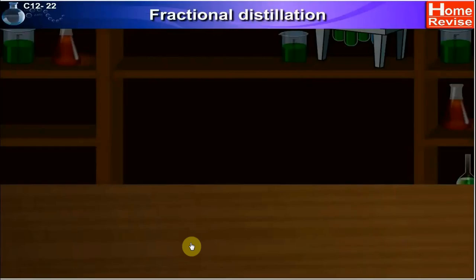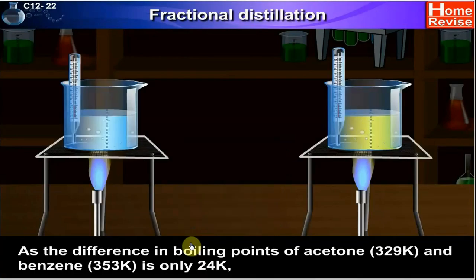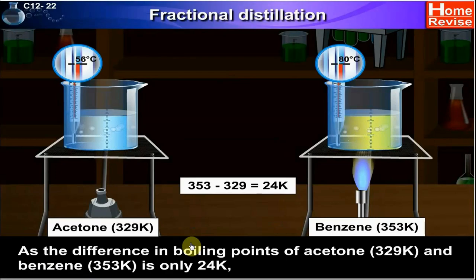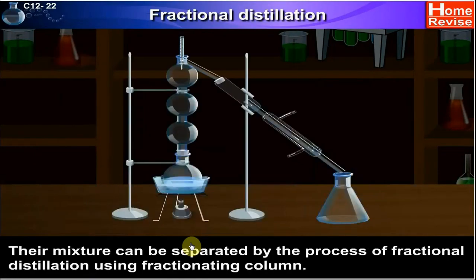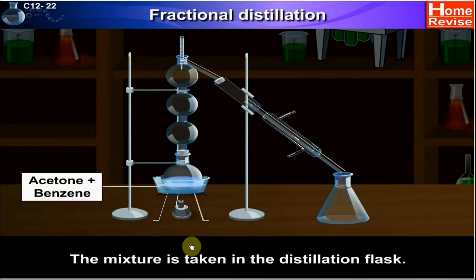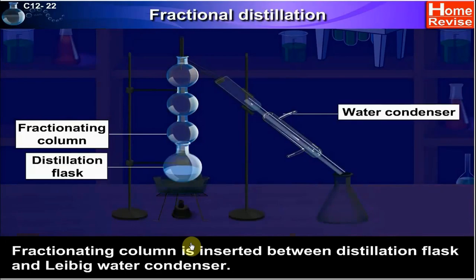Let's take an example: separation of acetone and benzene by fractional distillation. As the difference in boiling points of acetone, whose boiling point is 329 Kelvin, and benzene, whose boiling point is 353 Kelvin, is only 24 Kelvin, their mixture can be separated by the process of fractional distillation using a fractionating column. Let's see how this can be done. The mixture is taken in the distillation flask. A fractionating column is inserted between the distillation flask and the Liebig water condenser. The flask is heated on a water bath.